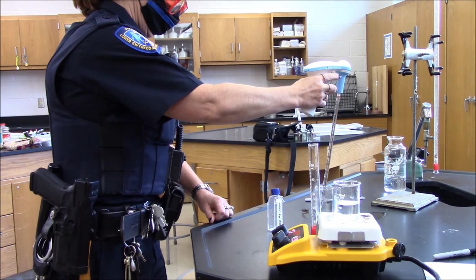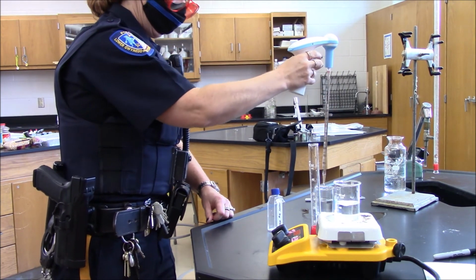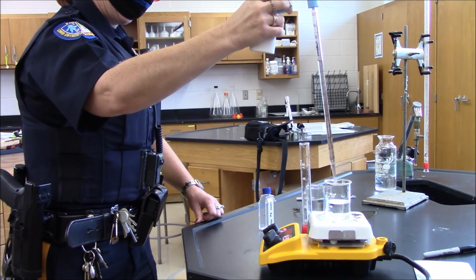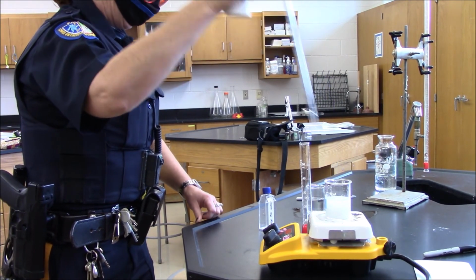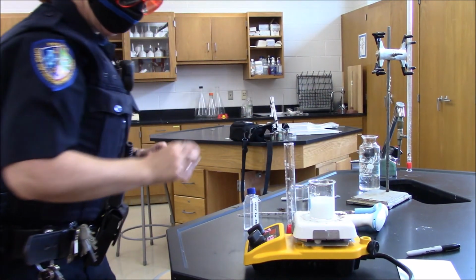Looks good. Okay, now you're going to add it to the stirring beaker. And look at that. What's happening? That's a white precipitate. It's forming between calcium ions and carbonate ions.